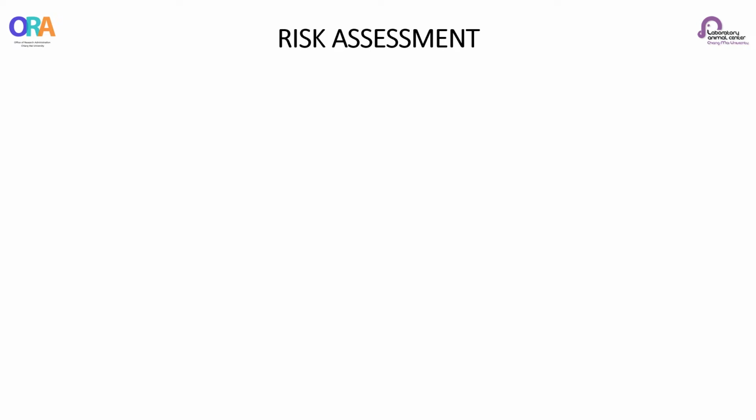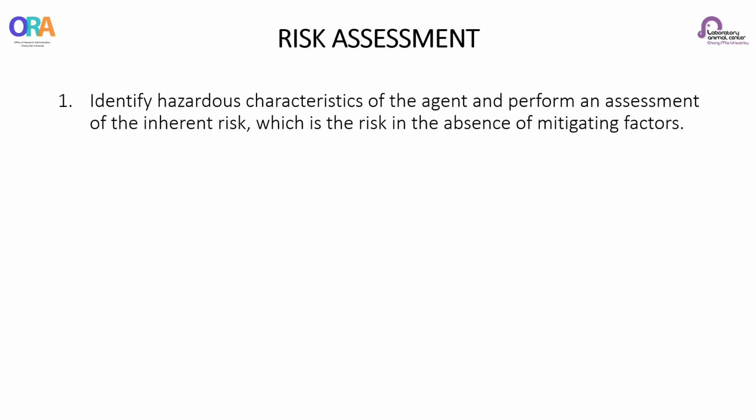This is the six steps of risk assessment. It is a six-step approach that gives structure to the risk management process and reinforces an ongoing positive culture of safety. One, identify hazardous characteristics of the agent and perform an assessment of the inherent risk, which is the risk in the absence of mitigating factors.